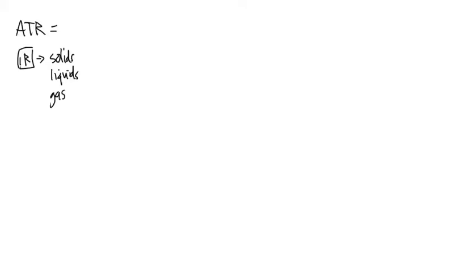And we can also analyze gases. We just need a specialized gas chamber so that way the gas cannot escape inside of the sample compartment, and we can seal it off and analyze the infrared just like before.